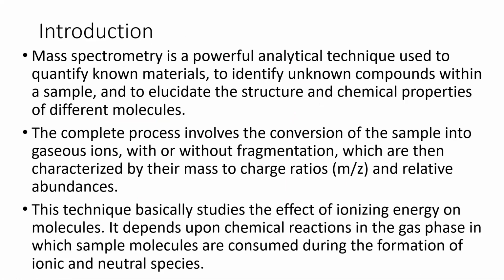So now let's go to the introduction of this technique. Mass spectrometry is a powerful analytical technique which is used to quantify known materials and to identify unknown compounds within a sample. So we use it for both quantitative and qualitative analysis of organic compounds. And like mentioned before, it is used to elucidate the structure and chemical properties of compounds.